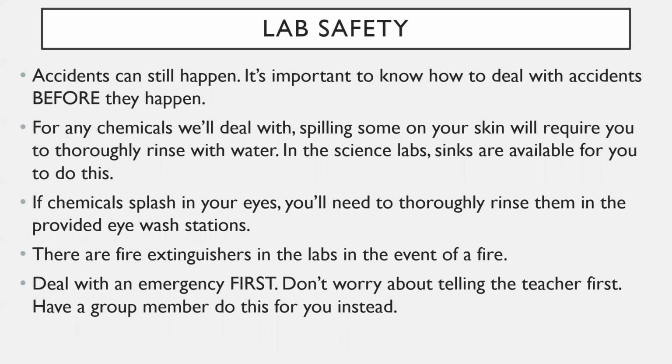If chemicals splash in your eyes, then you've got a bit of a bigger problem, of course. That's why we wear those safety goggles. But again, somehow accidents can still theoretically happen. You will need to thoroughly rinse them in provided eye wash stations. They are located in the science labs. Hopefully we'll have a chance to have a look at them. They're actually kind of neat how they work.